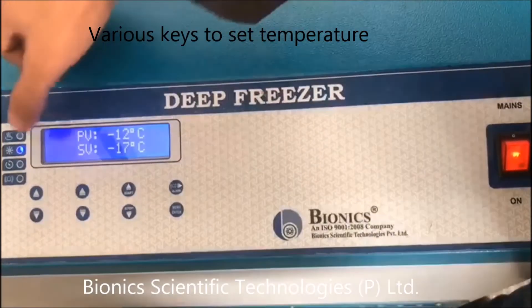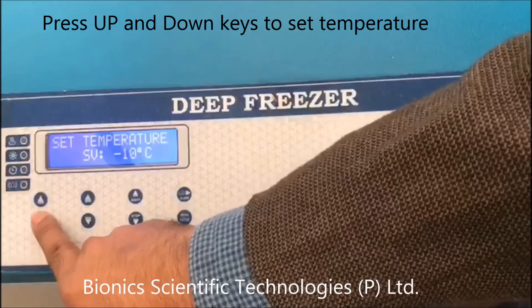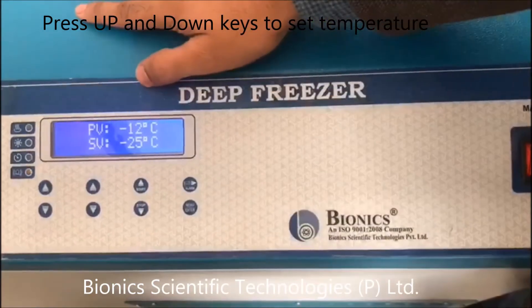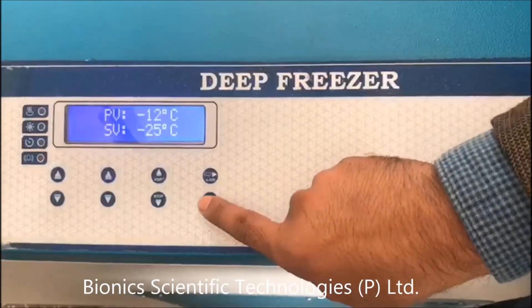To set the temperature, press this key. Suppose I need to set my temperature to minus 25 degrees Celsius — my present value is minus 12 degrees Celsius. Now I will press Enter.